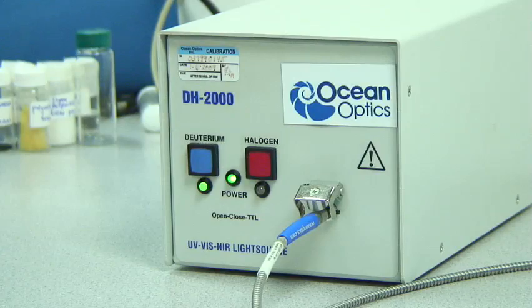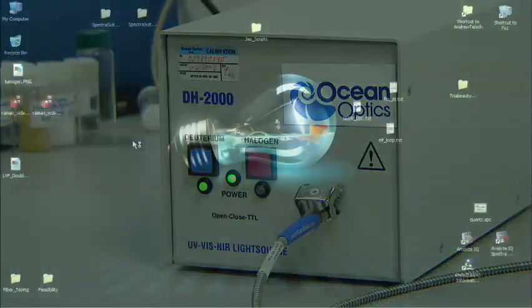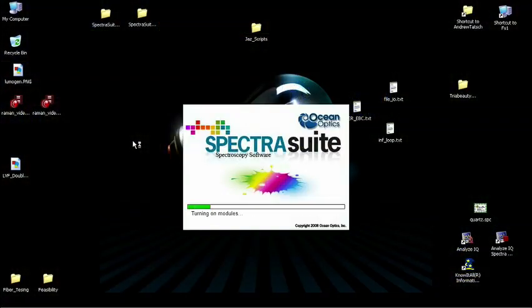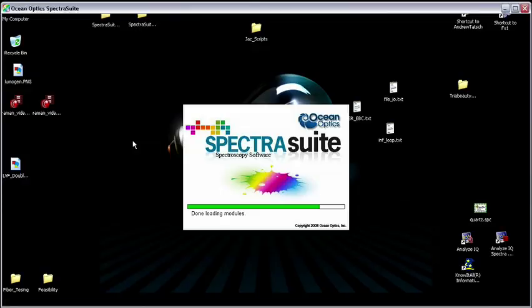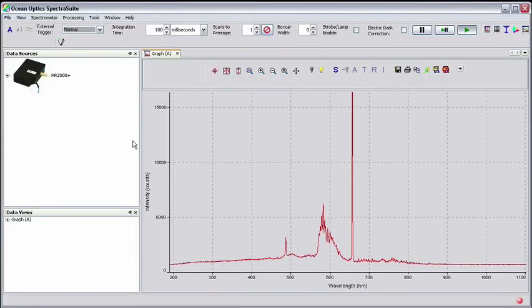With your setup connected and the lamp warm, launch Spectra Suite software. The calibration of the UV vis spectrometer could seem confusing at first.